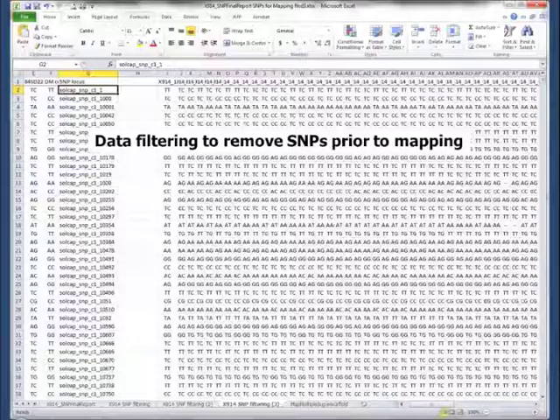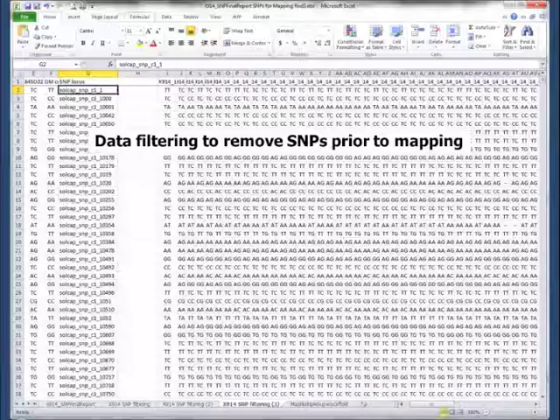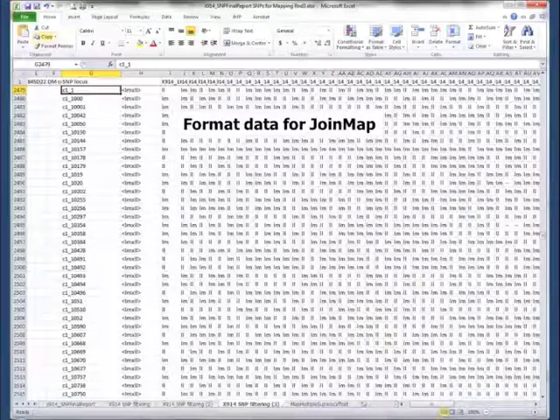There's a lot of data filtering that goes on here — things that I was working through to remove the non-segregating SNPs, and the calls that don't make sense. We've taken the file and now we've got the two parents lined up in the first couple columns. We have the SNP marker and then the progeny going across. You can see all the calls and the names for all the different progeny so that we can distinguish them.